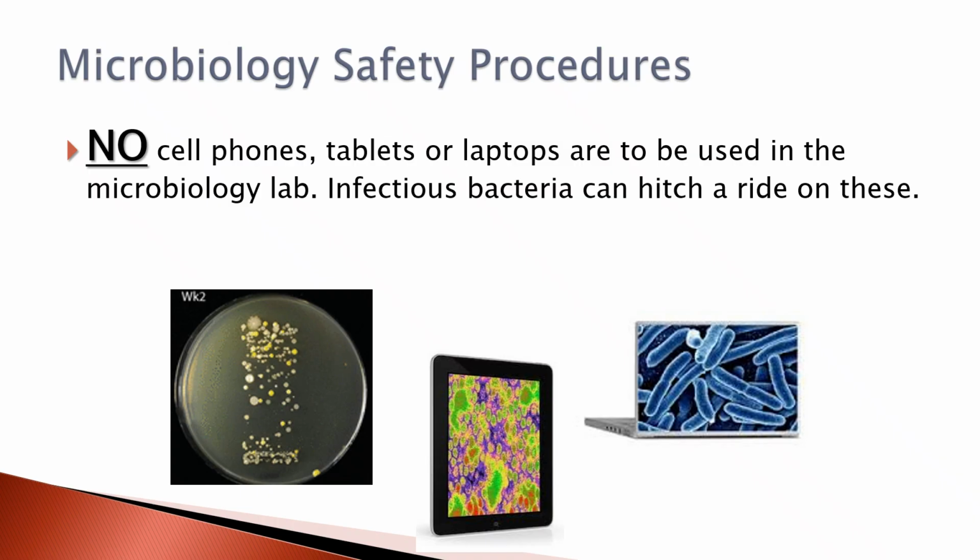The exception to this is sometimes cell phones. So I often ask students in lab to use their cell phone to take a picture through the microscope so that they can use it in a report. And if that's the case, we make sure that we put on clean gloves to do that. We get out our phone, we disinfect everything before we do that procedure. But I do sometimes ask that. But in general, your cell phone is not out in lab.